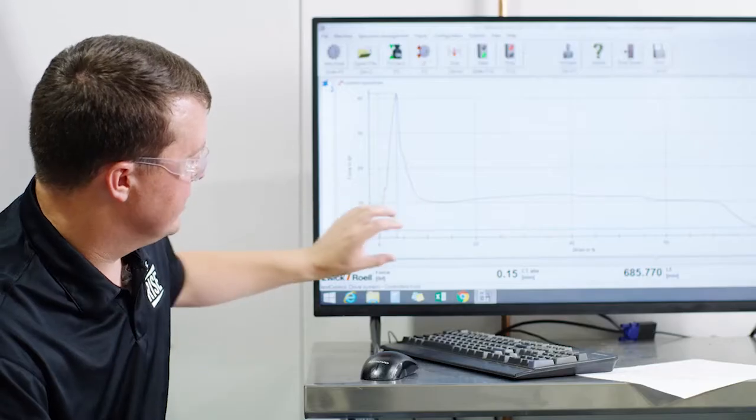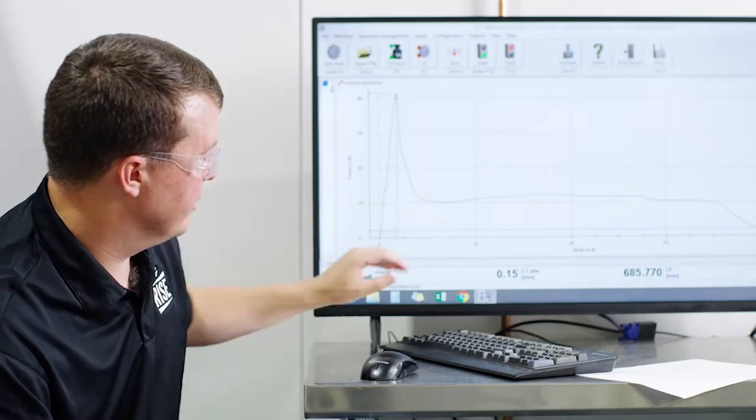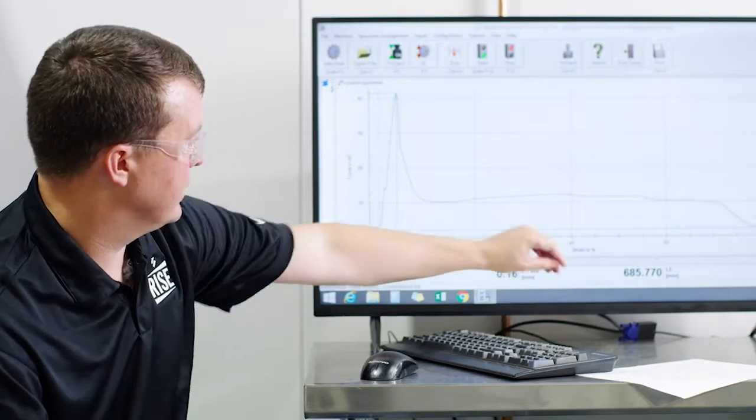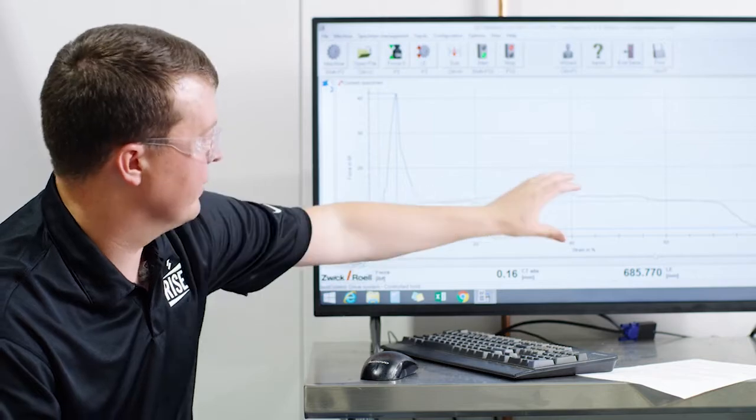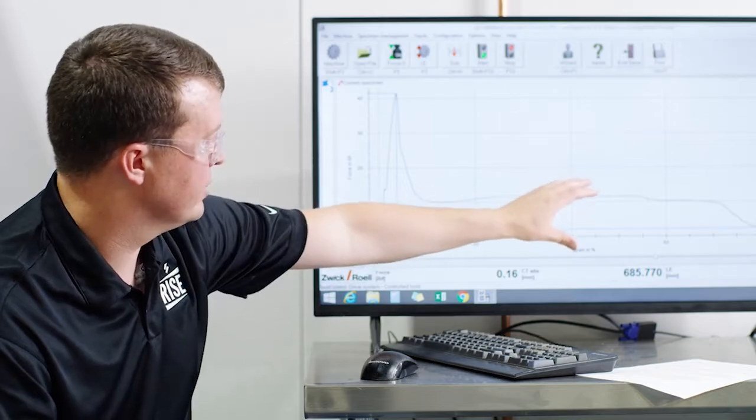And what you're seeing here now is the graph is starting to drop down, we're losing that load. And what we're picking up here now, this is the elongation. So this is our x-axis, we're measuring this elongation at this point.